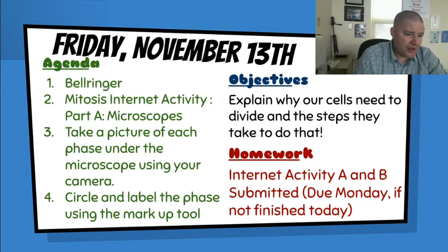What we're going to be doing today, I'm going to show you the mitosis internet activity part A, where you're going to be using the microscopes. I'm going to show you what it looks like underneath the microscope since you won't be able to do it there at home. And I'll tell you how you can complete the microscope mitosis activity. We have a workaround for you at home to be able to do that. So without further ado, let me transition it over to my microscope here.